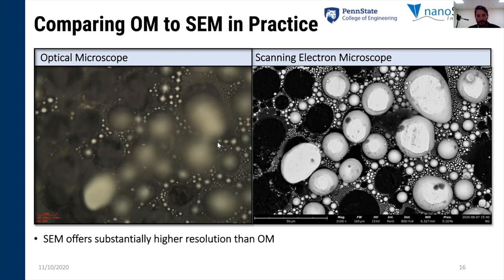SEM offers substantially higher resolution, which is what this slide's actually trying to show. If you look at this green box towards the right-hand side of the image, I've shown that there are some fairly small particles that we're detecting with the SEM, and the optical's hanging in there.